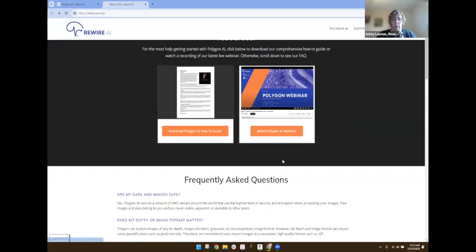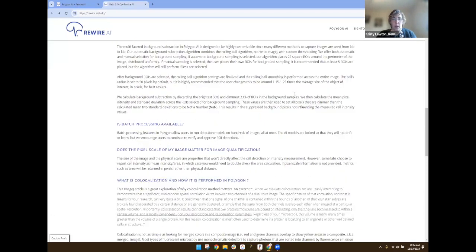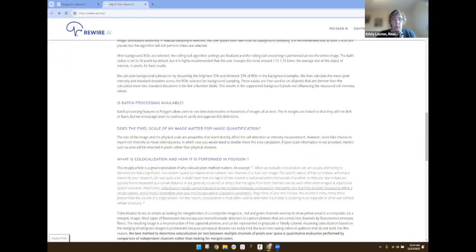Another really useful tool here, we also have an FAQ page. Commonly asked questions. We'll be adding more to this after this webinar.